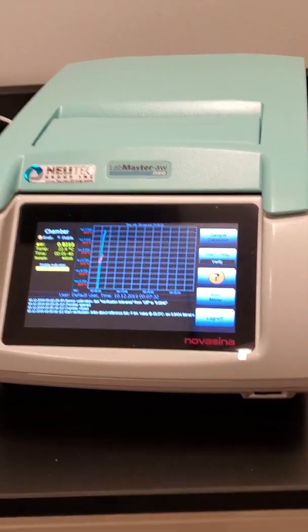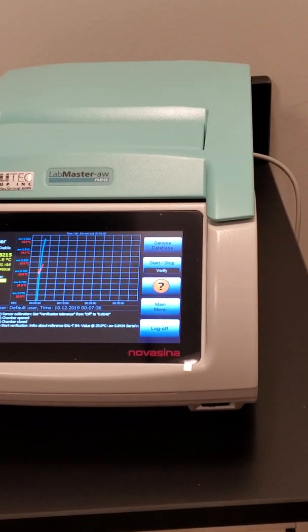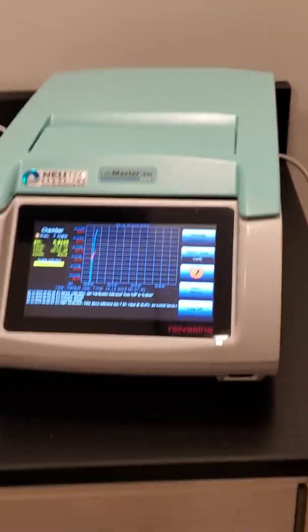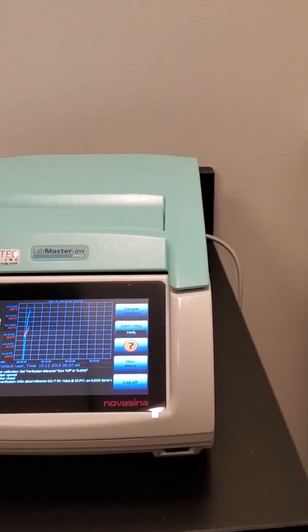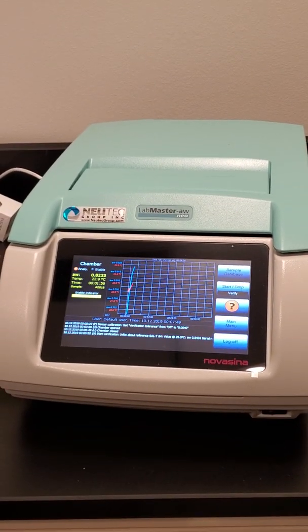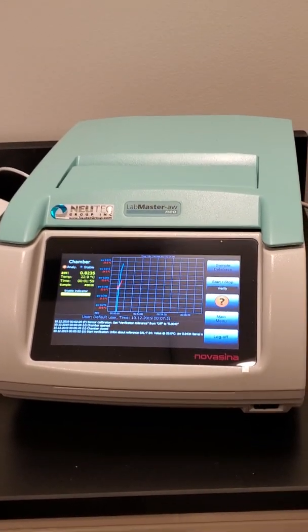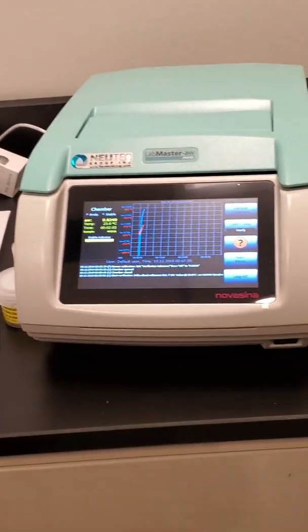The unit itself, does it need any calibration or preventive maintenance from you guys? Yearly. We recommend yearly, and with that, you get a new certificate that says that it met calibration requirements. There's an option for us to come on site and do that, or there's an option to send it to us. And obviously, the on site's a little more expensive.